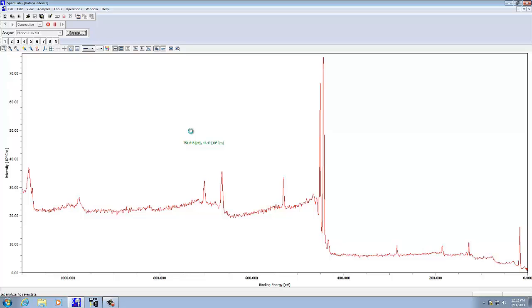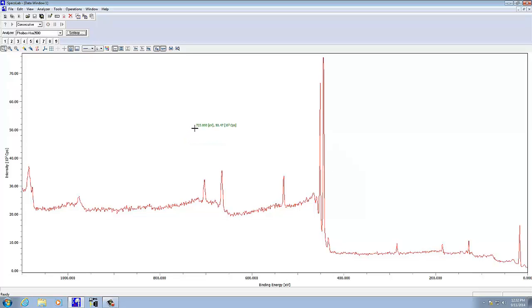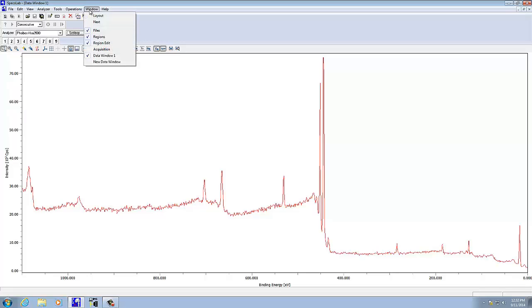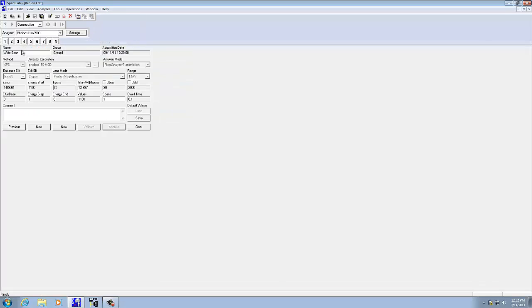The scan is done. If we decided that we wanted to add more scans to it to get a better signal to noise, we'd just go back to our regions edit, we're still in the wide scan, I could then add, change this number, and when I do that, then I could just hit validate and acquire, and it'll go back and add to that.